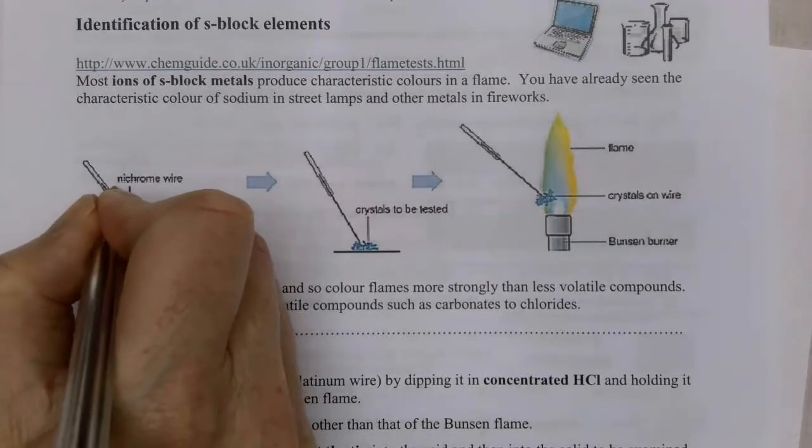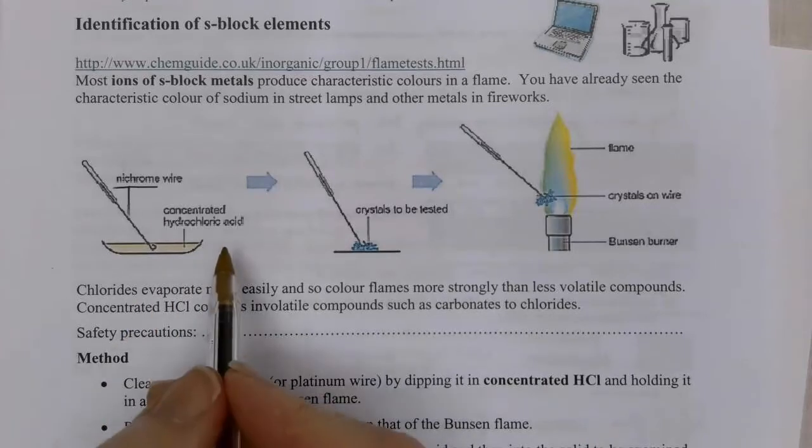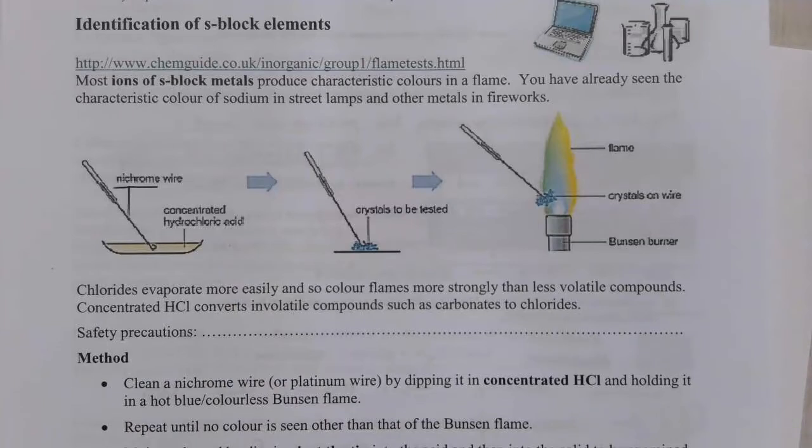Firstly, you need to use a nichrome wire. That's a nickel chromium wire. The reason we do that is it won't contaminate and it won't give a flame colour itself. So it's very important that you use the correct wire, nichrome wire. You dip that in concentrated hydrochloric acid. We would then usually clean it in the Bunsen burner flame until you see no residual colour.